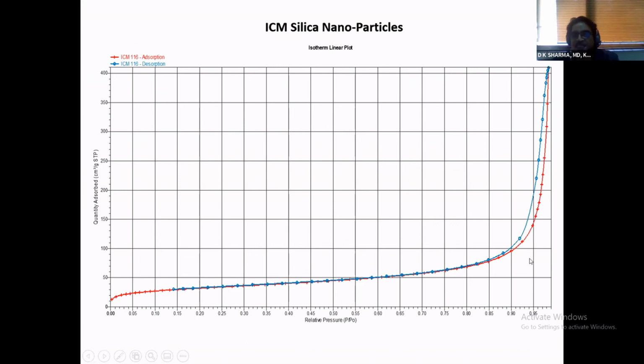The problem is when these nanoparticles are put as a powder, okay? I earlier told you nanoparticles are expected to be non-porous. When these non-porous, very, very small particles are put in the form of a powder, they have a lot of void space.